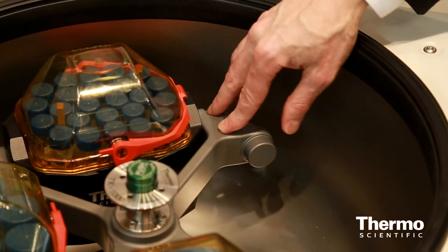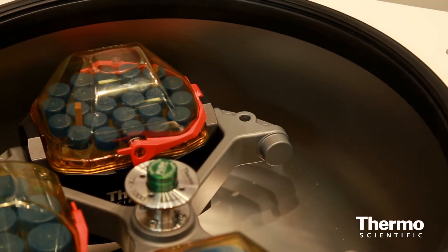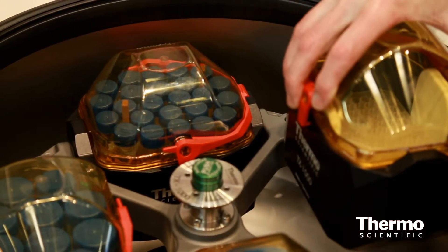This is a new lubricating and corrosion protection coat. So it reduces a maintenance step — there's no more greasing. And it's really going to protect that rotor for the longevity. So if you're working in a corrosive environment, the rotor isn't going to rust and corrode as easily as it would have in the past.